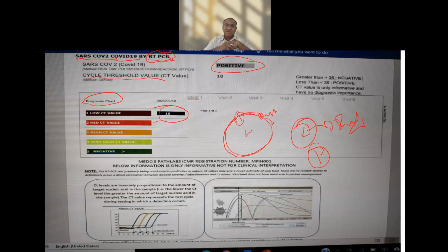Now we'll have a discussion once again when we understand all this process. I will present this slide to you once again once you understand all these things. Now, when I look at the left bottom of my cycle, where I'm putting my stylus, these are the graphical representation of quantitative measurement. What do you mean by a quantitative measurement here?